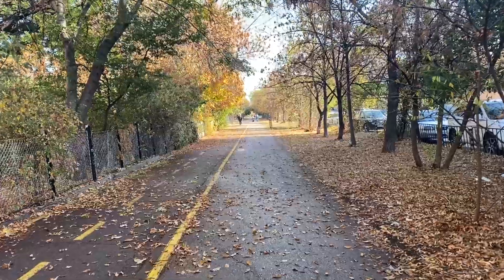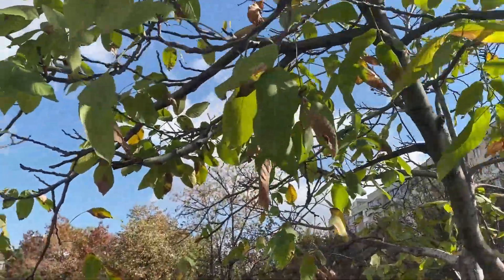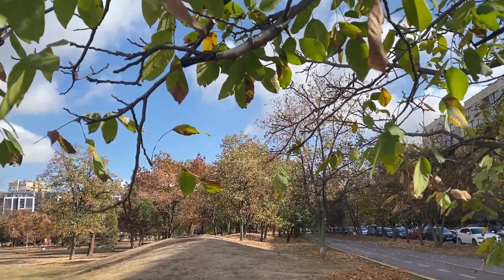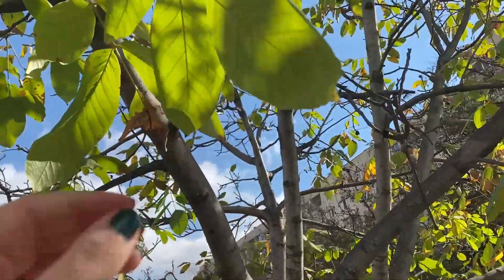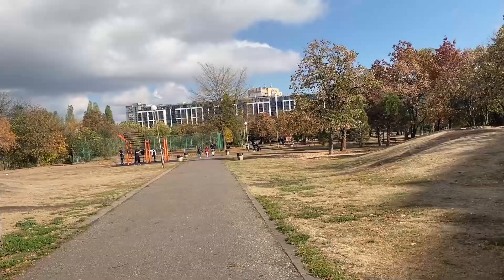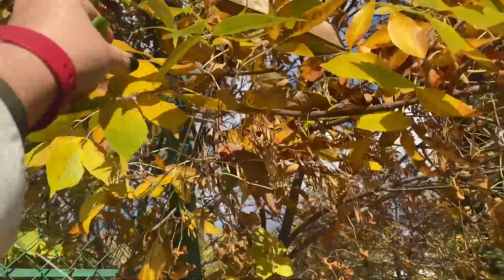I like this tree — let's take a green leaf. Most trees, as you can see, are orange or yellow or brown, but this tree has lots of green leaves. Let's take a sample — this is a good one. Now let's go get a yellow one and a brown one.